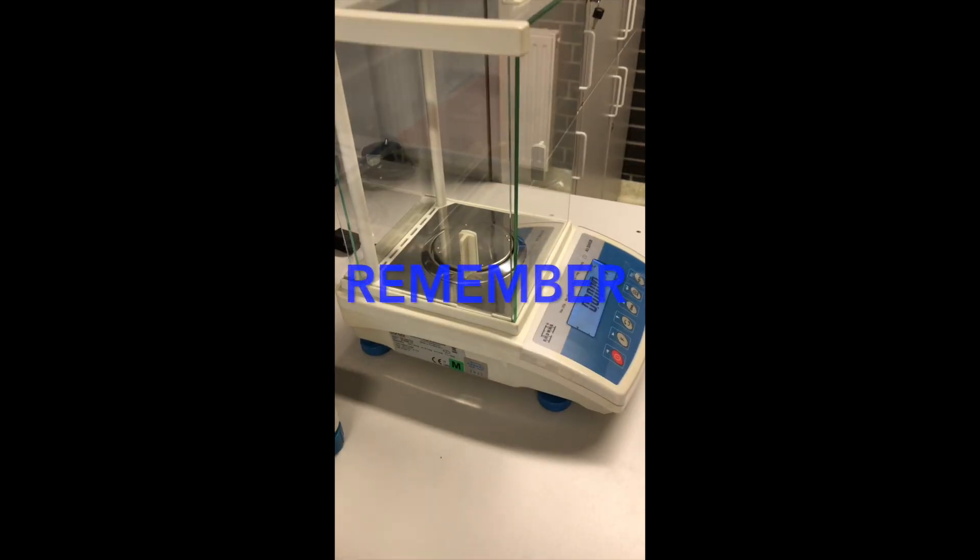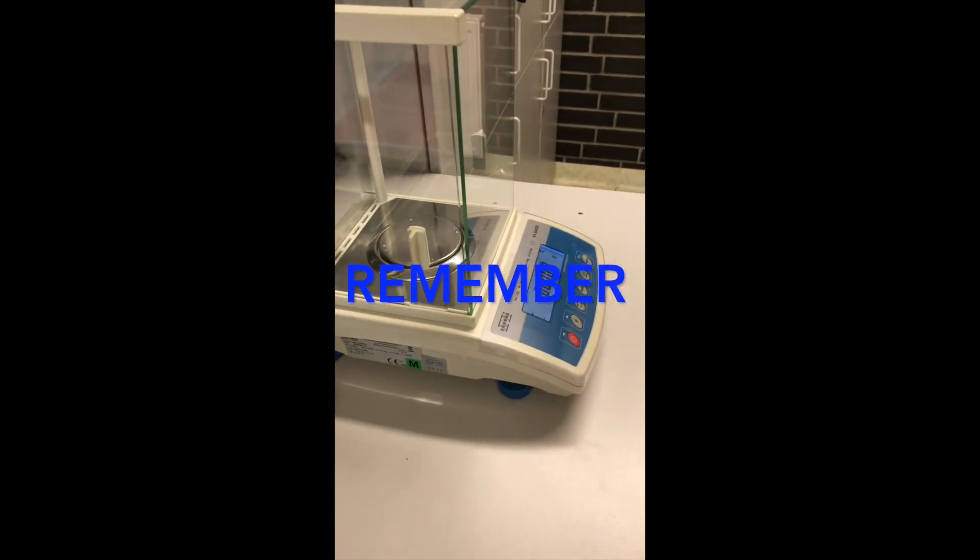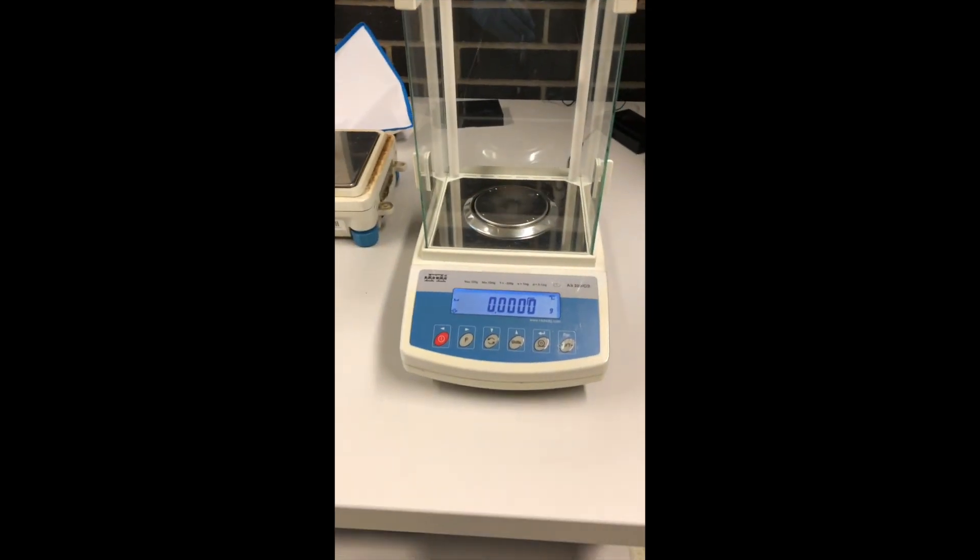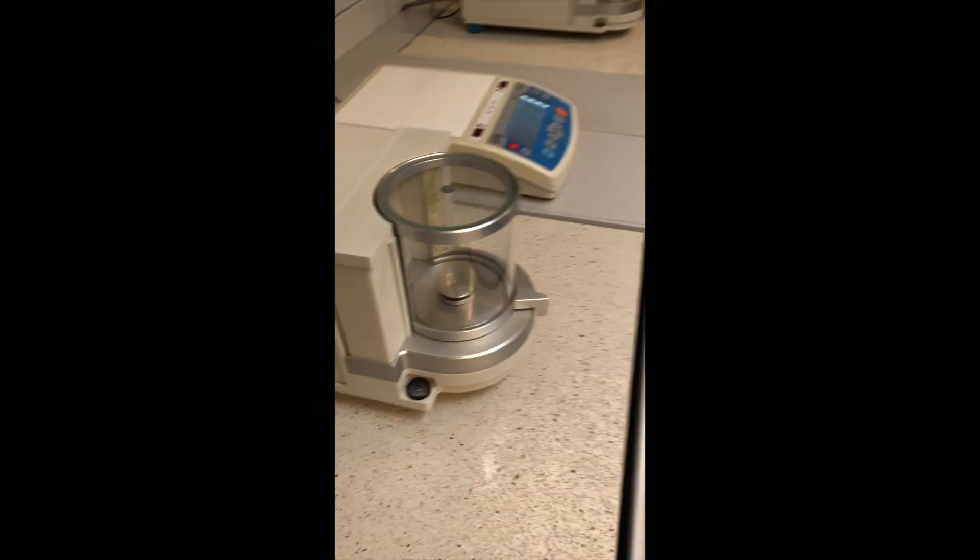There are different types of balance. You would use this one in the laboratory, but there is also more professional balance in the weighing room.